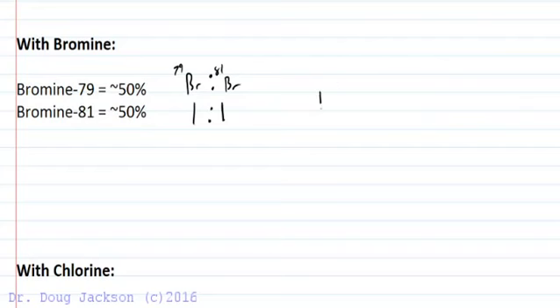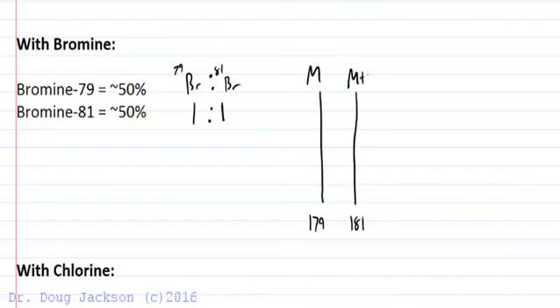So in our spectrum, you're going to see a molecular ion, say it's at 179. Well, you might have at 181 an M+2 peak that is an isotope peak of the molecular ion, and then you might have a carbon-13 peak of each one of these that is an M+1 or an M+3, but the molecular ion is going to be the lower of the two.